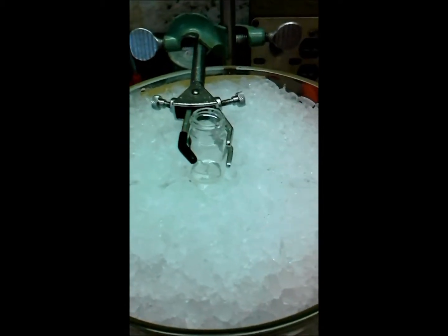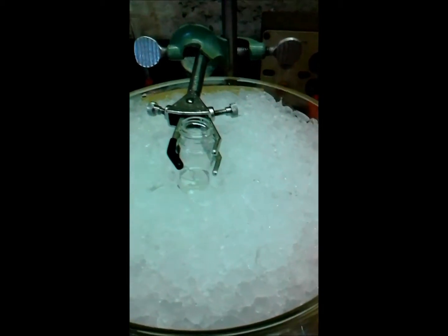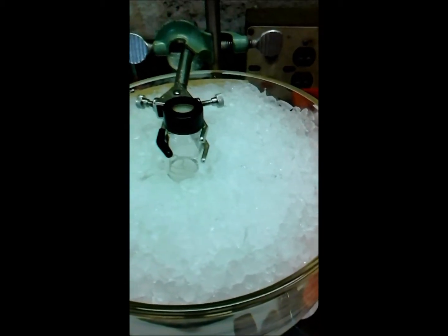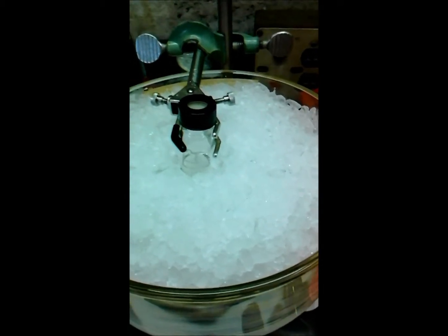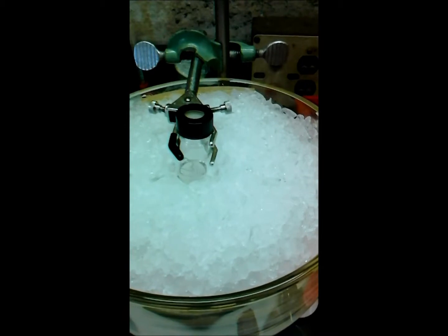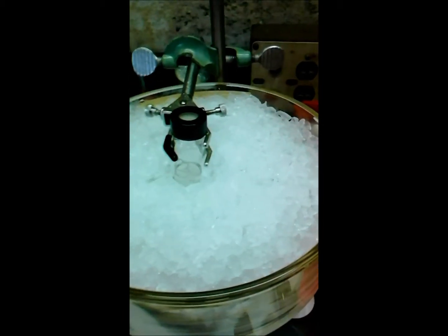So we're going to be adding about 700 microliters total, 4 times the molar equivalent of the Meldrum's acid that's in there. And we want to do it over a period of about 10 minutes, but since I don't have any kind of addition funnel that is accurate with small volumes, I'm just going to separate it out into 200 microliter additions spaced a few minutes apart. The reaction solution still remains clear.